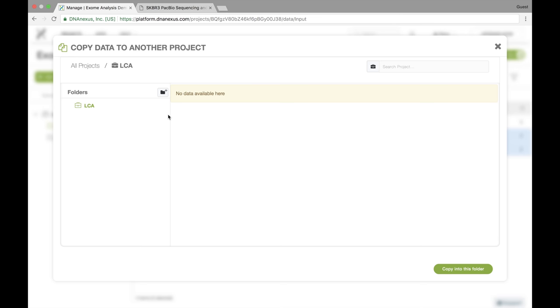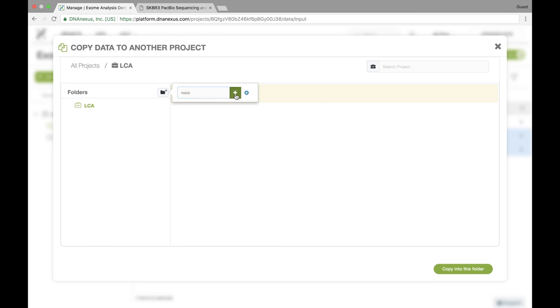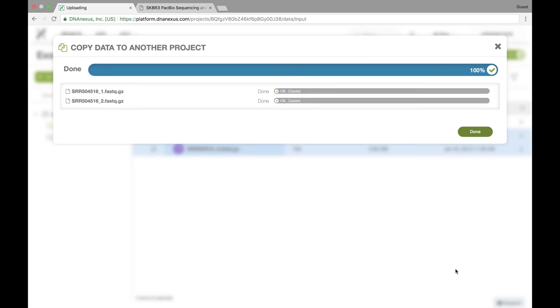And while I'm in here, I can actually create a new folder as well. So I want to do that because I want to keep my data well organized. And I just want to call this reads because these are going to be the raw reads. And so now I have that folder selected. I'm going to say copy into this folder. So now that publicly available data is going to be copied into my project.